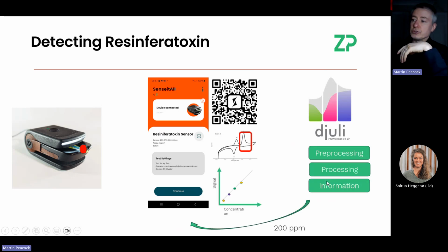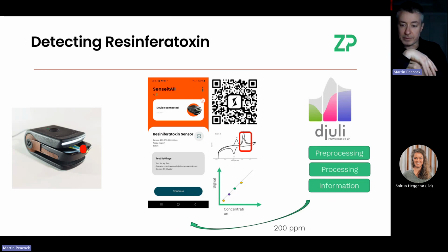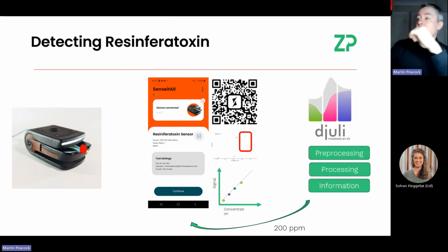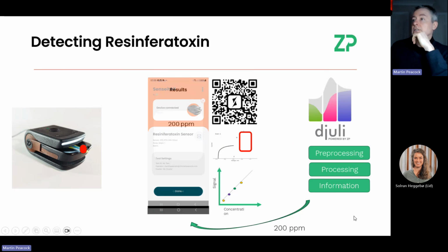So this is a very useful tool, probably when you want to know a result quite rapidly. The manufacturing process may actually be going on, for example, or there may be some IQC or OQC going on, PQC. Then this is a tool that can give you a rapid result.